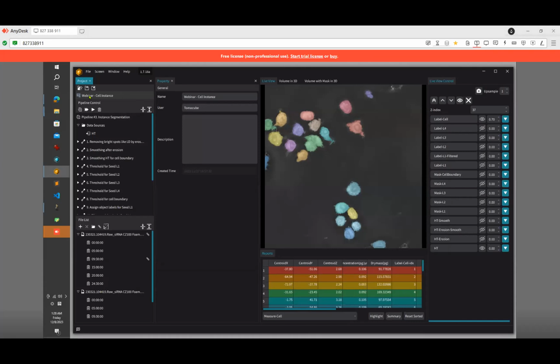So when you review the result, you can also see the values used for that analysis. So you don't need to write down all the parameters during your experiment. Rather, you can see or reload the parameter set that was used for a certain job or batch test. So that's incorporated in the analysis pipeline.